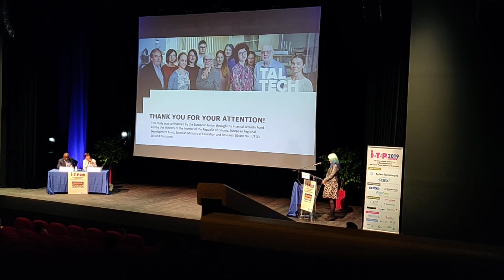Okay, thank you for this nice presentation. I have a small question concerning the validation of your method. So, according to the EMA, have you investigated the stability also, because some of your compounds seem to be quite sensitive to oxidation, for example? Yes, of course. We have covered the stability over 6 months.